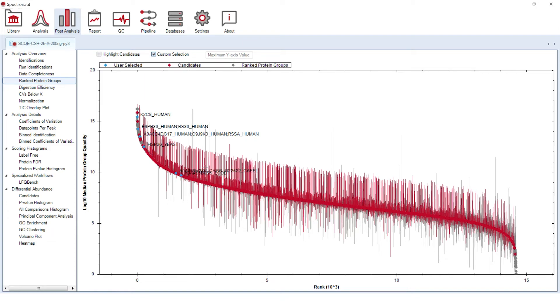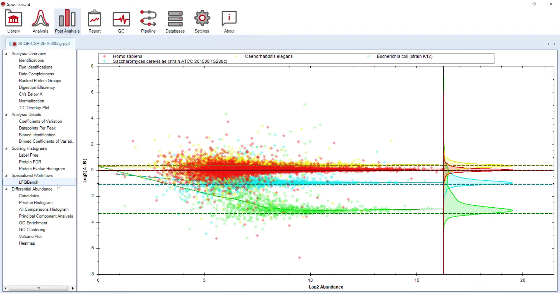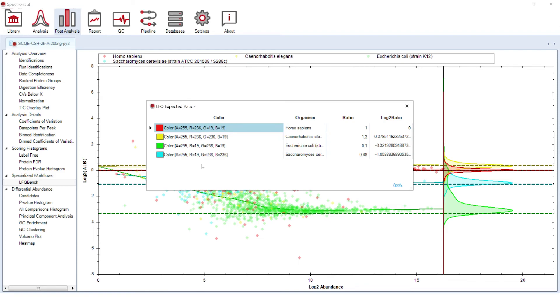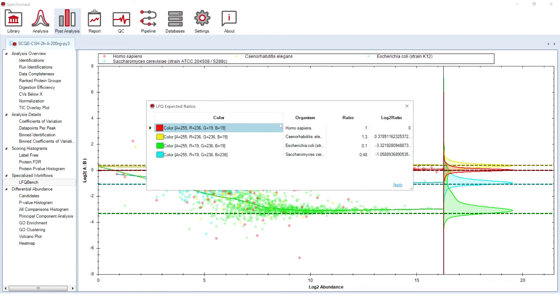For the benchmarks including mixed-species samples, Spectronaut features a dedicated LFQBench plot. The plot will be generated automatically if more than one species is detected in selected FASTA files. The expected ratios, dashed lines, can be set by right clicking on the plot. The distributions on the right side of the plot show how the experimental values diverge from the expected ratios.